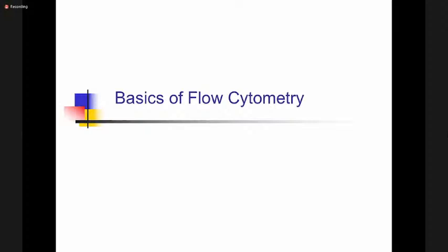So what we are going to cover today is not wholesome of what needs to be covered in flow cytometry. Flow cytometry can at times become a bit more complex. It used to get more complex to me when I was training, when I was doing my postdoctoral training. And I'll just mention to you the types of flow cytometry which are there.